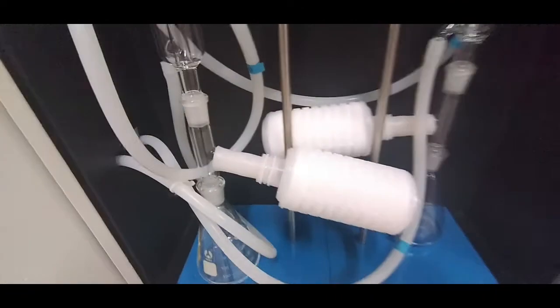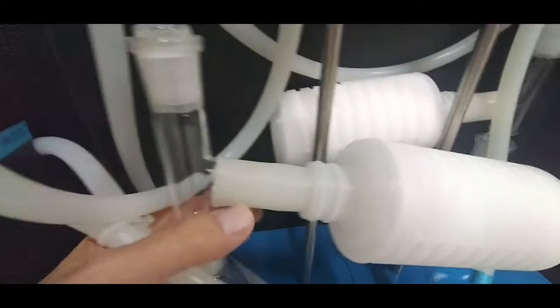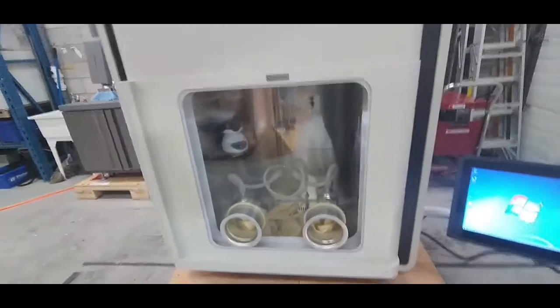The filter goes on the T tube using the supplied gaskets. Here is the front interior.